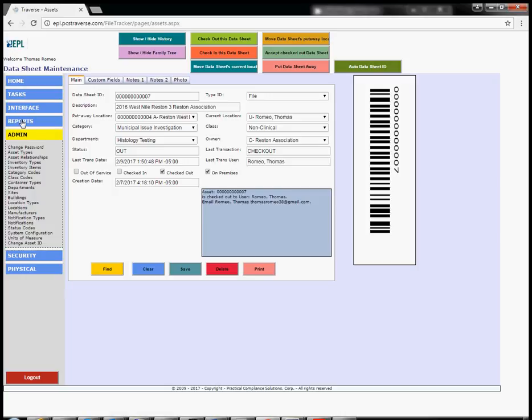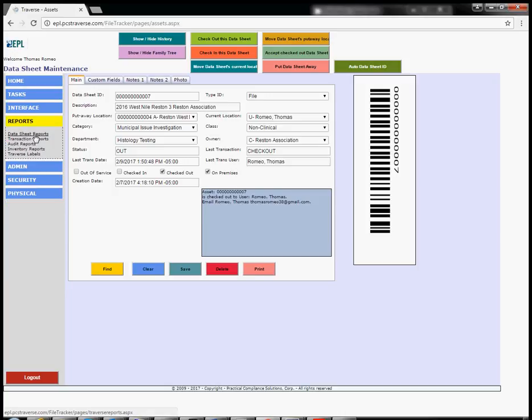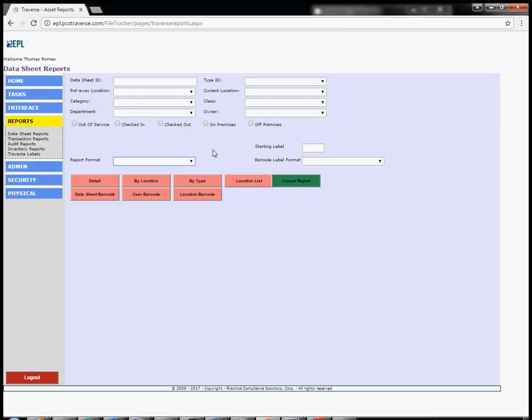Well, we're not going to go into those things. Why don't we just go quickly at the reports, and then we're going to end the video because I don't like the videos to take too long. So report formats can be Excel report, Excel sheet, HTML, PDF, Microsoft Word. The default is PDF. If we're printing barcode labels, there are different Avery formats.